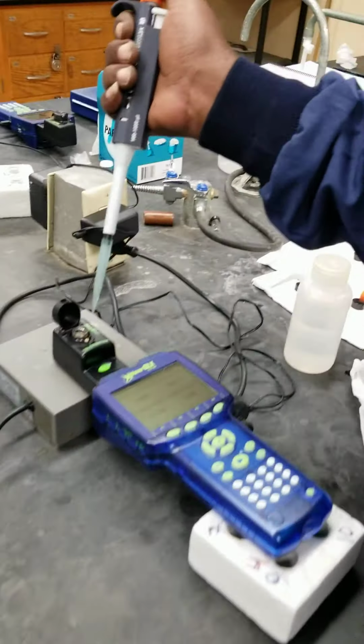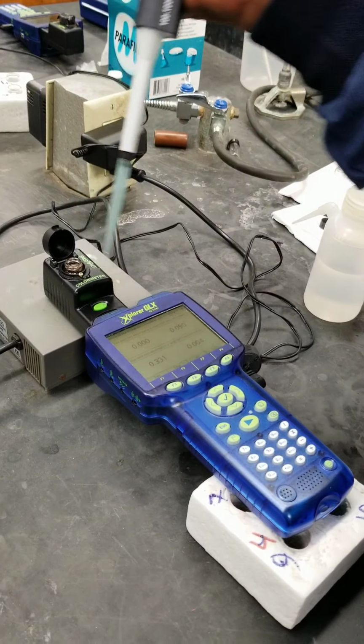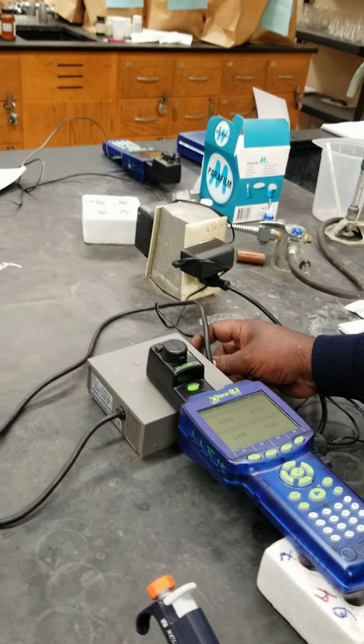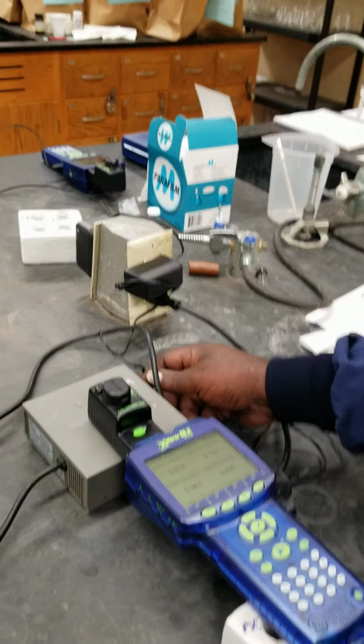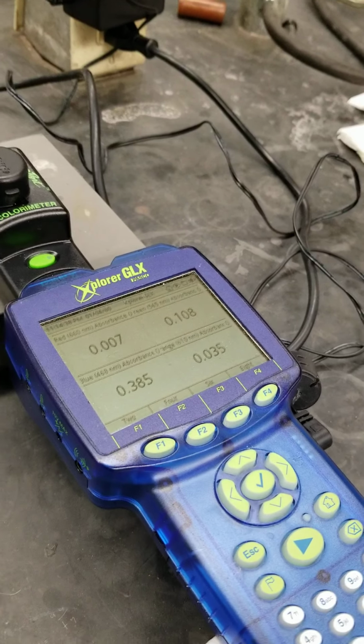The third addition: add it, close, stir, turn off the stirrer, wait for values to stabilize.